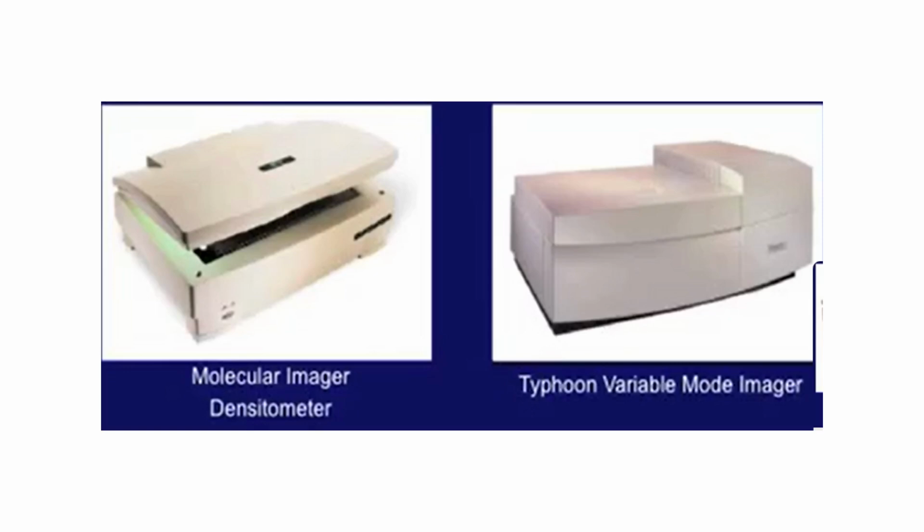There are different instruments available just to visualize the gel, and if you want to do visual interpretation and compare the results, you can do all of that. Then densitometry or the Typhoon variable mode imager. These are two, maybe you can say, a little advanced instruments in order to perform analysis.